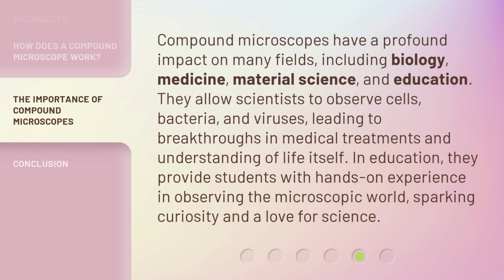Compound microscopes have a profound impact on many fields, including biology, medicine, material science, and education. They allow scientists to observe cells, bacteria, and viruses, leading to breakthroughs in medical treatments and understanding of life itself. In education, they provide students with hands-on experience in observing the microscopic world, sparking curiosity and a love for science.